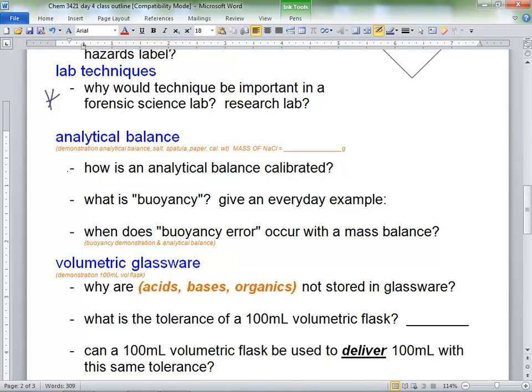Okay, so it's zeroed. And notice all the windows are closed. Get my little micro spatula. Okay. Open up the side, and I open up the side so that it's right in line with where I want to work. So then I can do the little tapping thing. And the tapping thing is nice because then I can get whatever mass I want. A lot of times, oh, get 0.01 grams or whatever the case is, right?